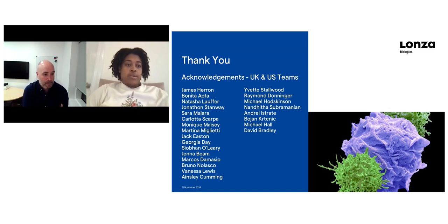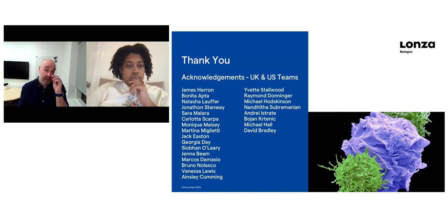Thank you. Next question. In your ADC example, how are the MAPS correlated with the DC/T cell assay readouts? Fully expected that question. We don't know yet. We haven't run those assays. I'm not sure whether our client would run those assays in-house before we run the MAPS. So that's something we're going to look at: in a PBMC proliferation assay or a DC T-cell assay, do those differences pull through, or is it more complicated than that?